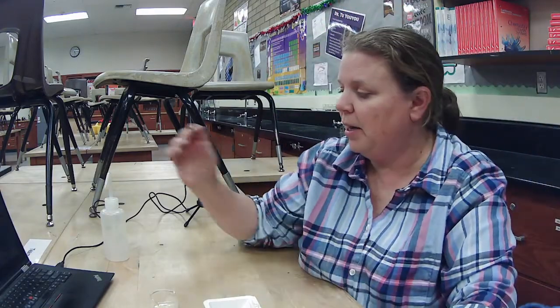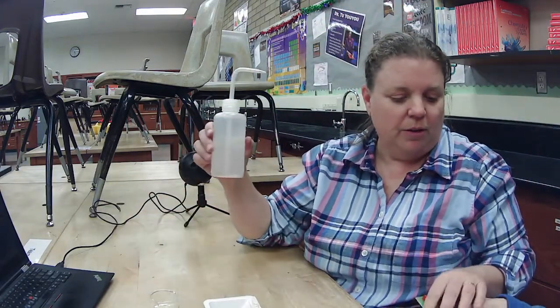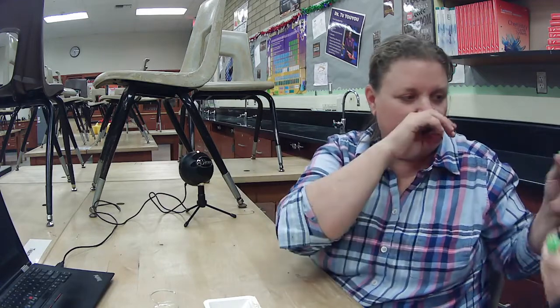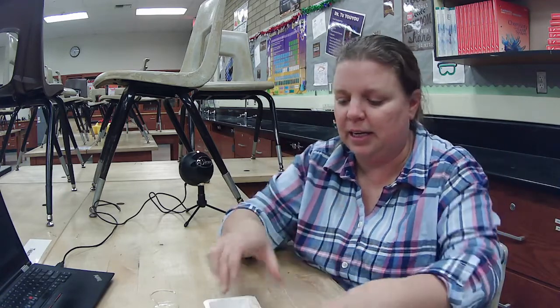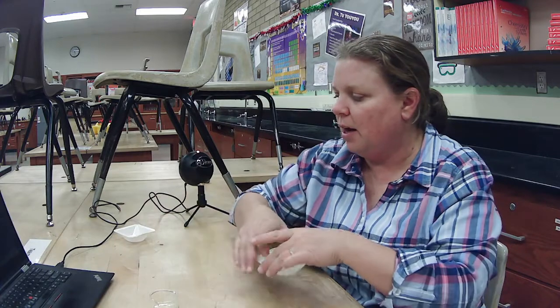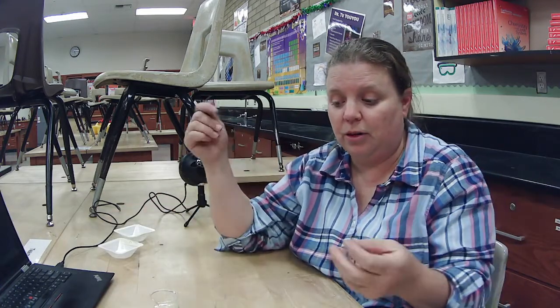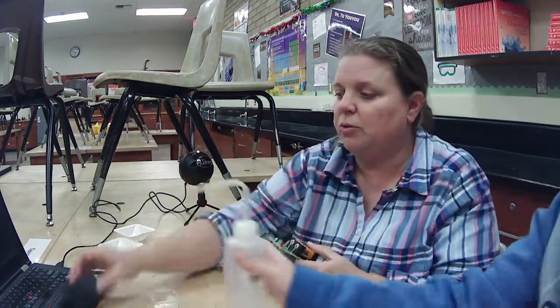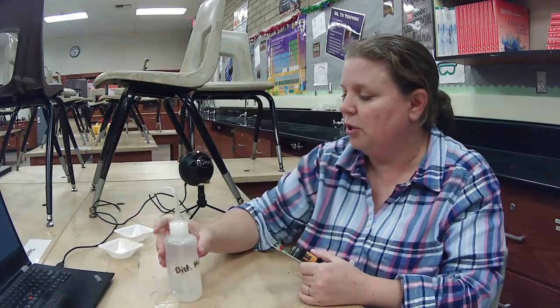I'm going to send Josie over to the sink. Can you squirt this off for me? Just squirt the prongs, don't get the battery or anything. She's going to squirt that off with distilled water just to clean it, so that it doesn't have any contamination as we test the other things. Thank you, Josie. The next things we're going to test are our solutions.